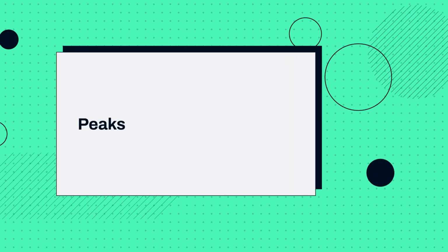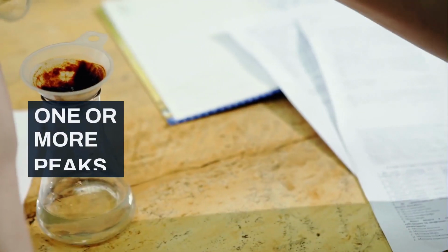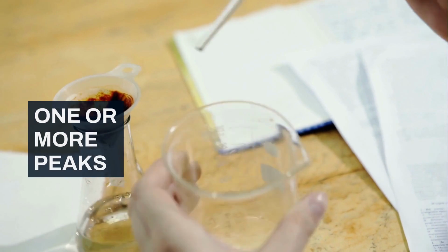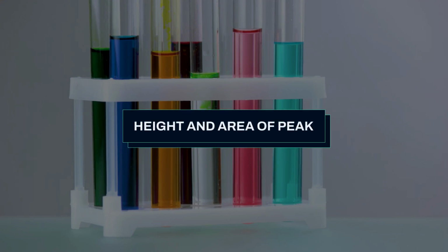Now, let's talk about the main features you'll see: peaks. You will see one or more peaks on the graph. Each peak represents a different molecule or group of molecules that have been separated and are now eluting from the column. The height of a peak is important. A taller peak usually means there is a larger amount of that specific substance. Similarly, the area under the peak also indicates the quantity of the substance.